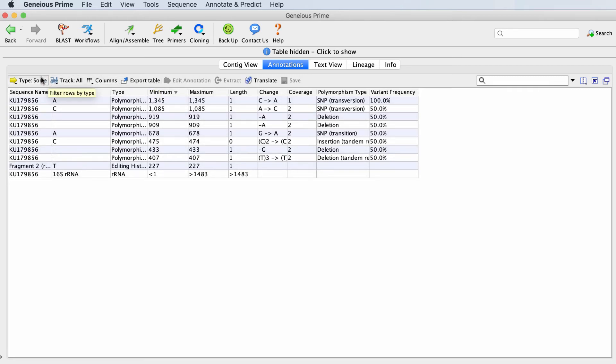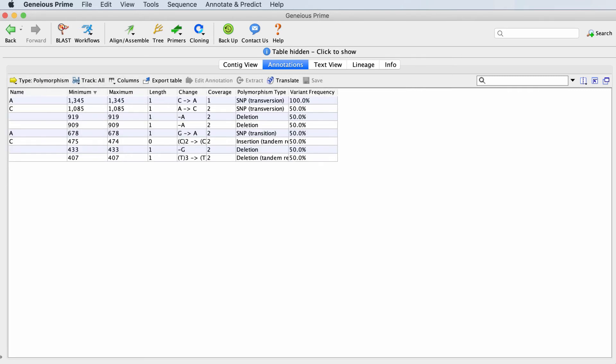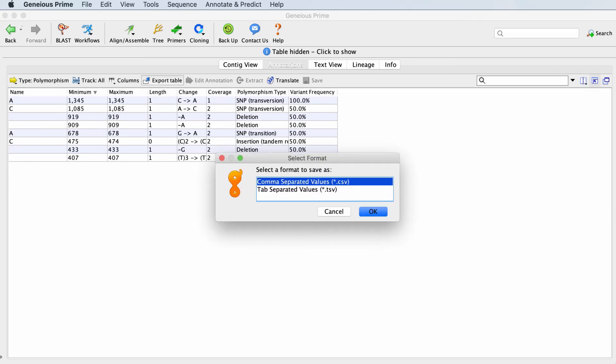Click Type and choose Polymorphism to display only polymorphism annotations. You can export the table to CSV using the Export Table button.